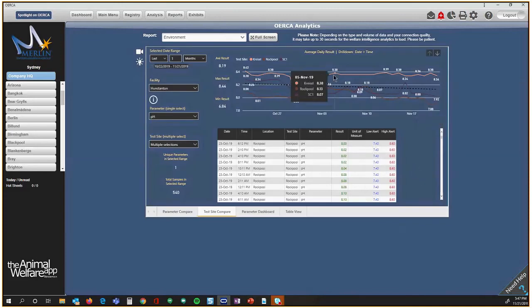Also, just to note, and this is important, many of you might only record one sample a day or one parameter a day, but there are occasions, especially for those of you linked to Sinai, that might have 2, 3, maybe even 4 or 5, who knows how many samples per day. The way this line graph works is it only reports or shows graphically for each day. So if there are multiple data entries for that, it will average them.